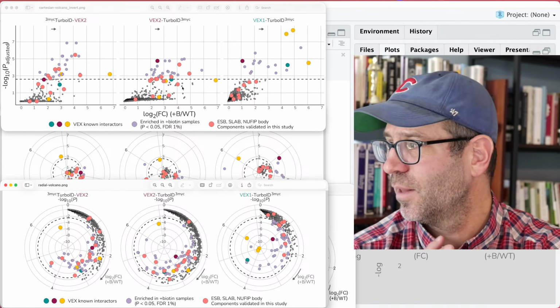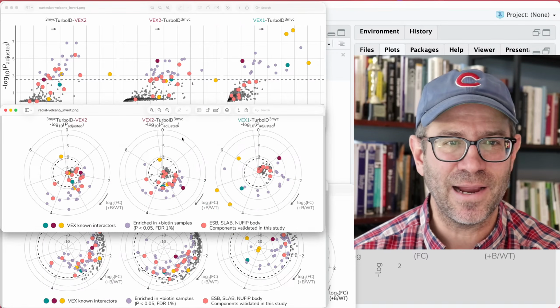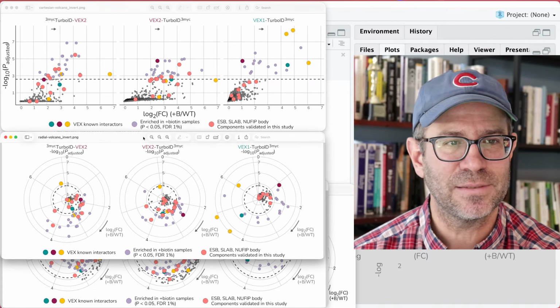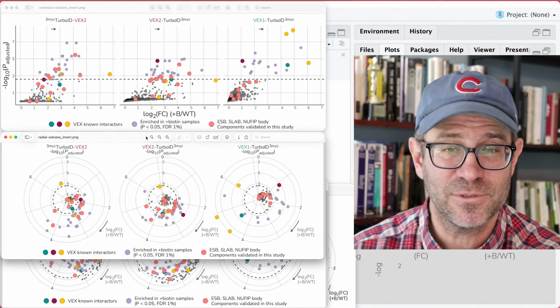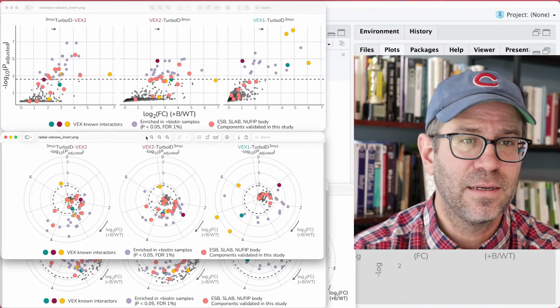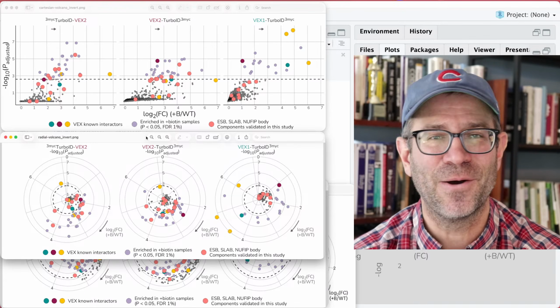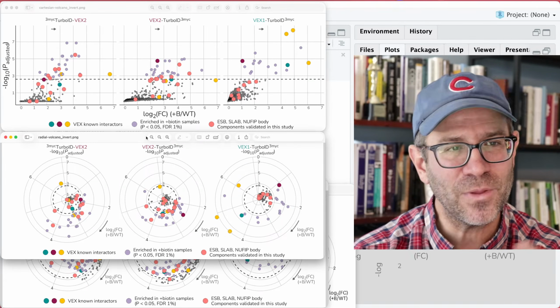But anyway, let me know what you think. Again, I did not get either of these plots to a state where I would be happy publishing them, just to be perfectly clear here. And that's okay. Maybe I'll clean up a little bit of stuff before I post it. But hopefully you get something out of this.